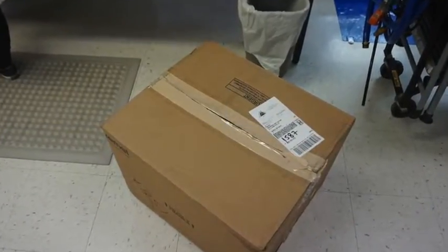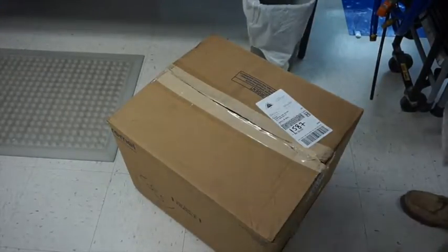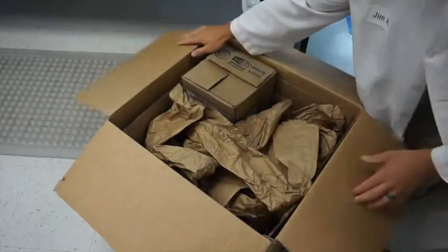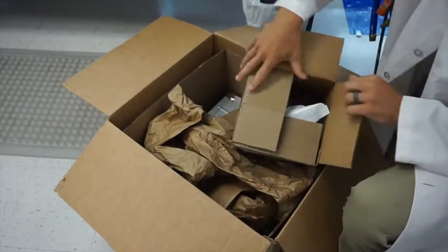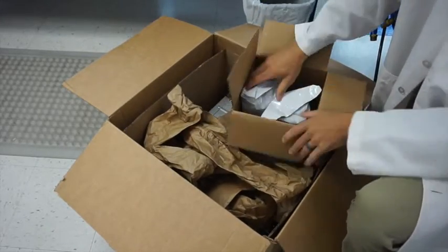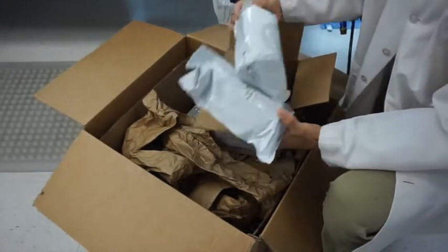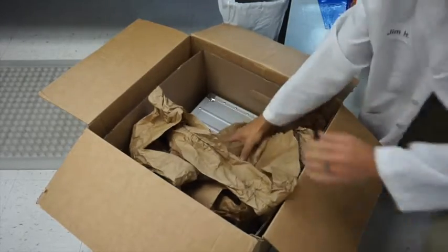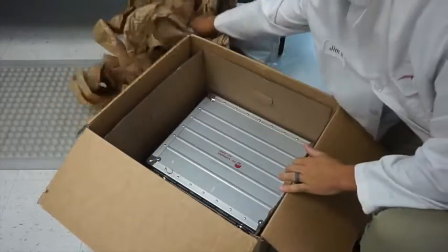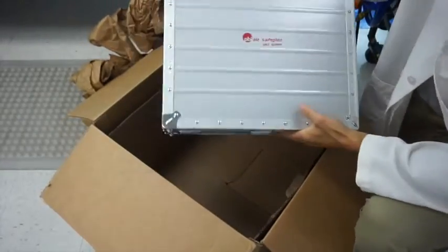When you receive your resample kit it's going to come in a large box like this, and when you open it up there should be two smaller boxes. The smaller box is going to have your media inside of it, whether that's SDA for fungal growth or TSA for bacterial growth. They will come in sleeves that shouldn't be open. Also inside there is going to be a silver case, and that's the actual viable air sampler.